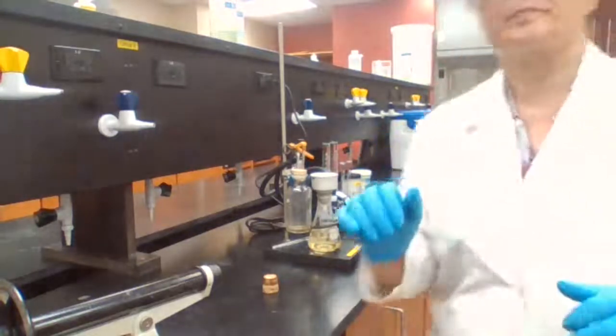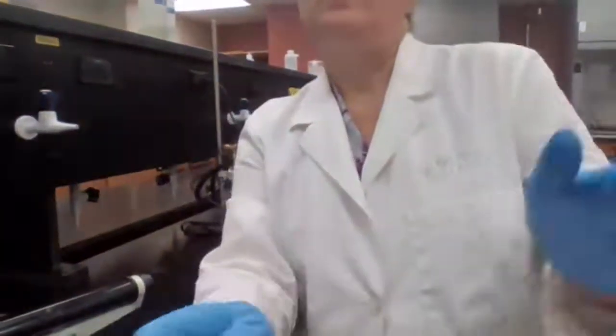Okay. So rinse the crystals with methanol, and what's next?